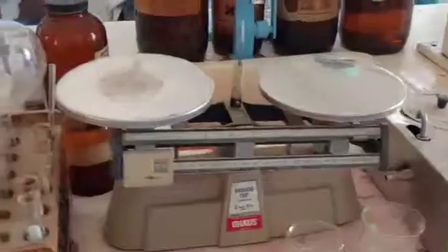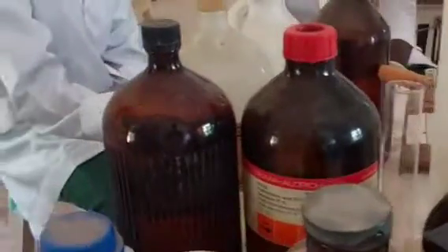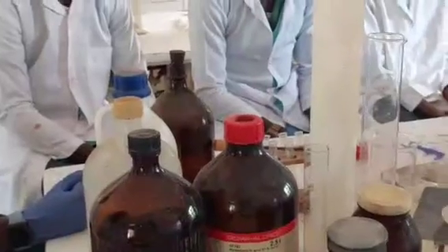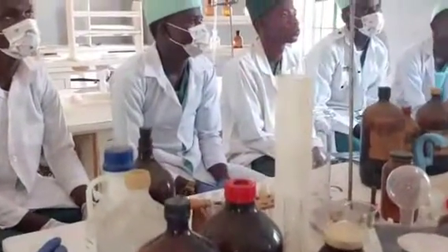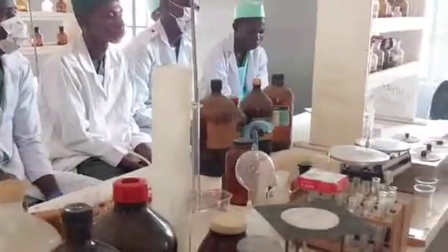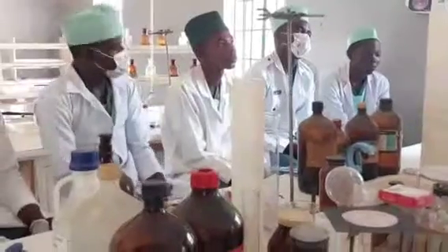And when you are using the glasswares, laboratory glasswares should be washed and rinsed before and after use. Why will you wash and rinse? It's to avoid contaminants. And we also have chemical wastage should be minimized.